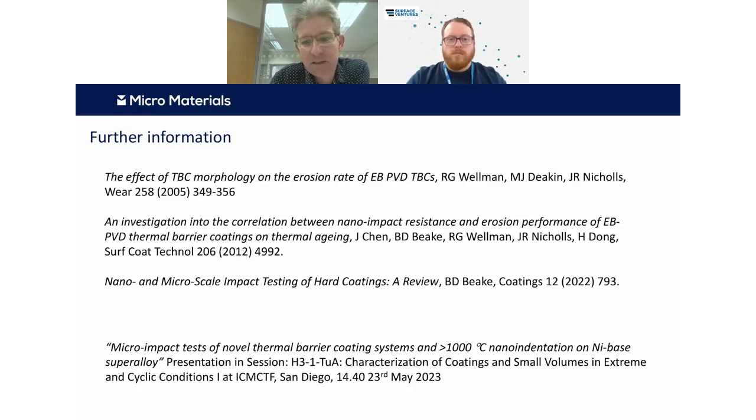So the impact test itself has been tested effectively on polymers, because you can use metrics such as energy damping. It's particularly useful for viscoelastic materials, where you might have high strain rate differences in energy dissipation that allow you to design more protective materials. We have customers working on those applications for device layers and also multi-layer paint systems, where subsurface damage might come into it. But the random impact test I hadn't really thought about for polymers yet. Maybe that's something to think about.